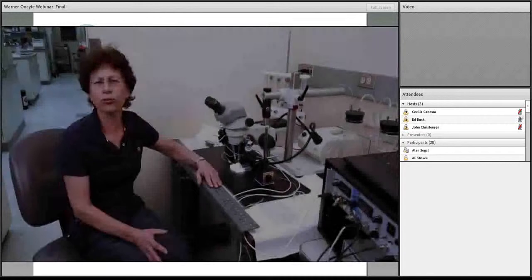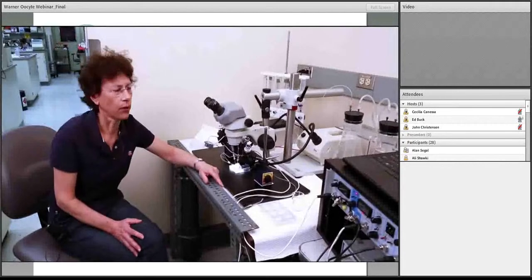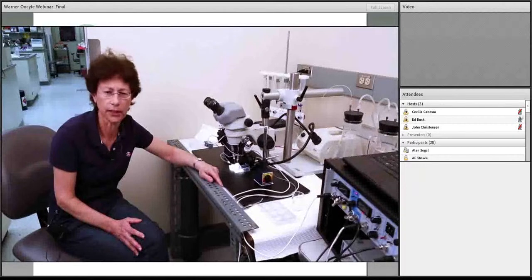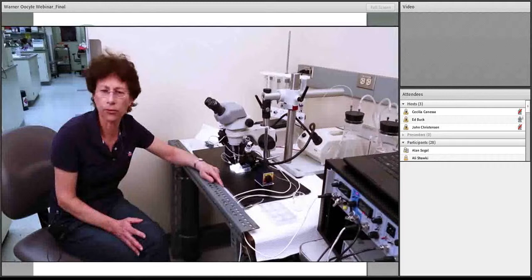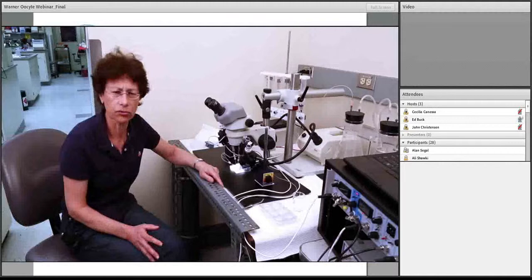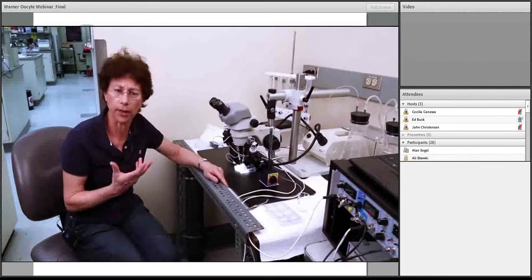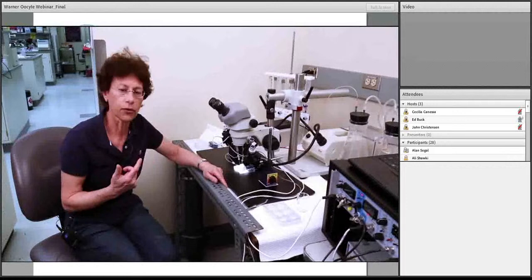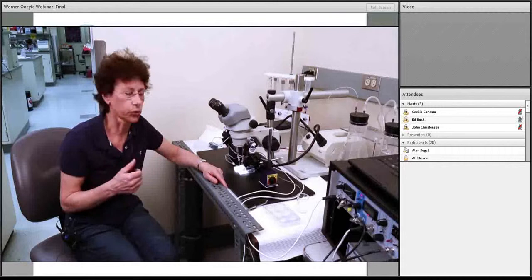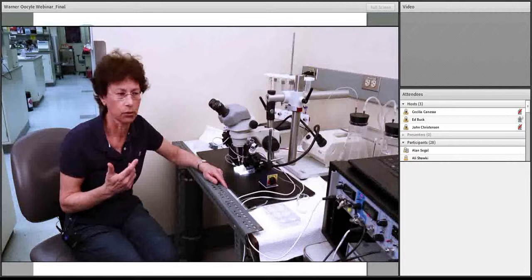So I'm going to introduce you in this short film to the two-electrode voltage clamp. This is a very useful technique when you want to characterize proteins that are electrogenic. There are only two conditions that need to be met. The protein of interest has to be expressed at the plasma membrane, and the other condition is that it has to be electrogenic. So it's good for studying ion channels, transporters, ion pumps.